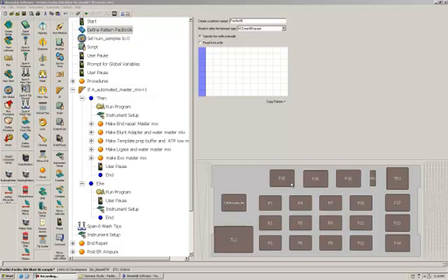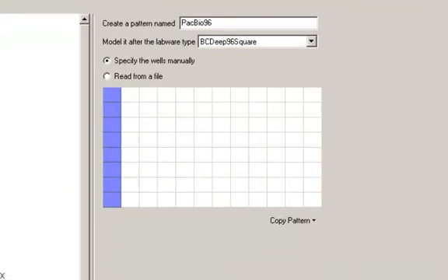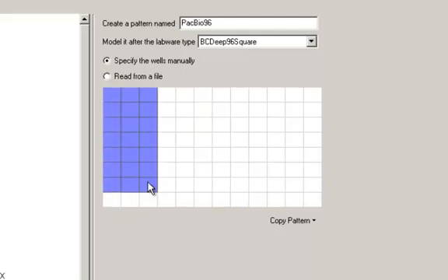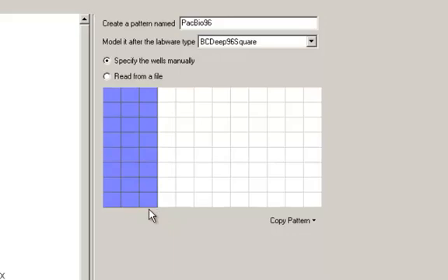Before you even run the method you're going to want to tell the method where your samples are in the 96 well plate. You do that here in the second step of the method, the define pattern step. Basically right now it's set up for eight samples in column one, but if you were running more samples you just basically click and drag where your samples are in the 96 well plate.